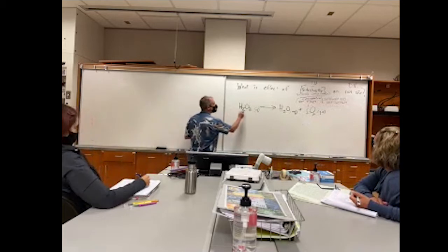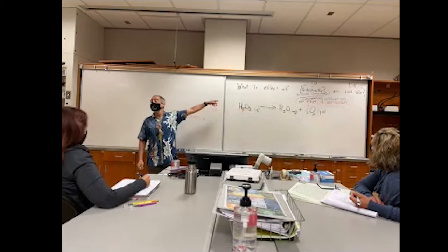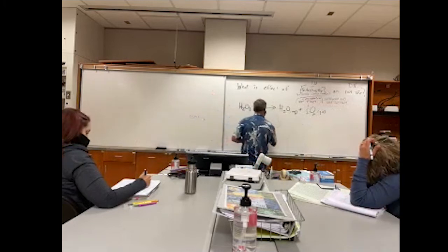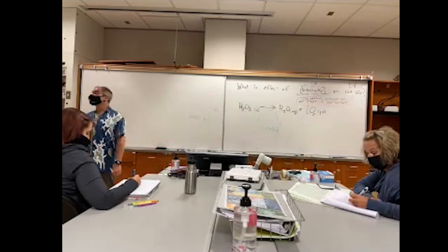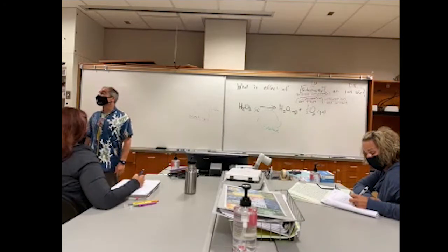This may happen really slowly on its own, but we want to make it go fast. We use an enzyme. So we're going to have an enzyme called catalase, which will catalyze this to make it go much faster. This is something that is made in your liver.